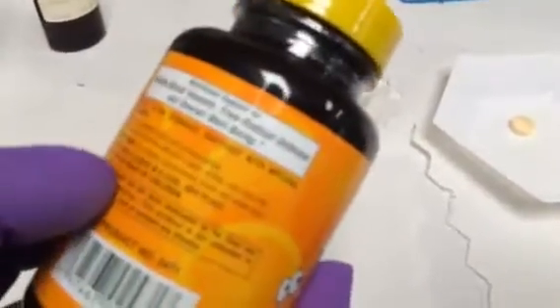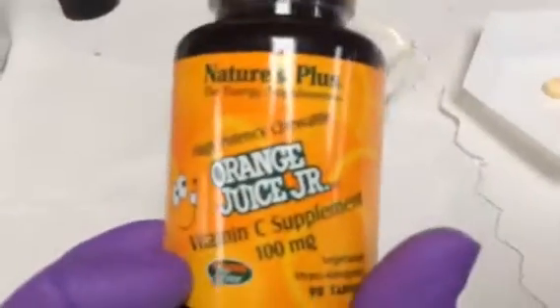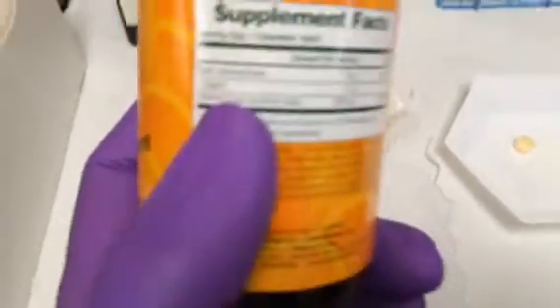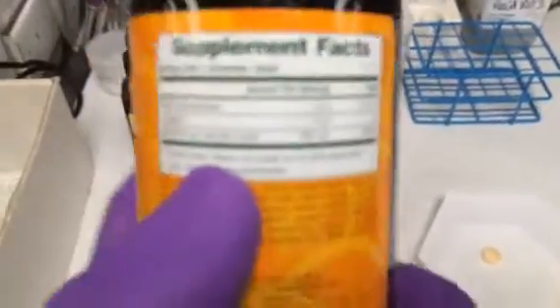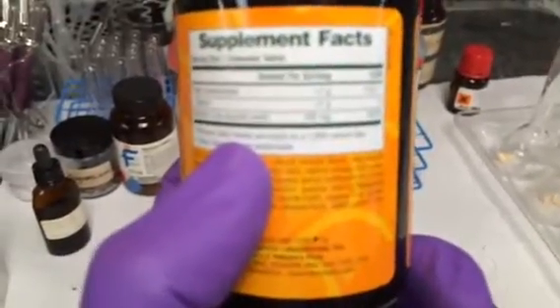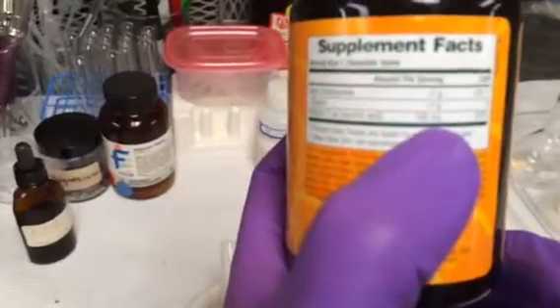We're going to do the determination of the vitamin C, ascorbic acid, and this is from the service store. If we're looking through this, you might see the vitamin C content — it's about 100 milligrams.